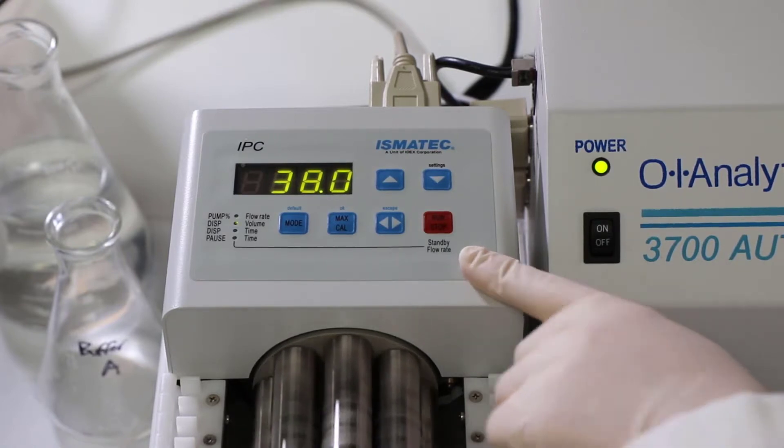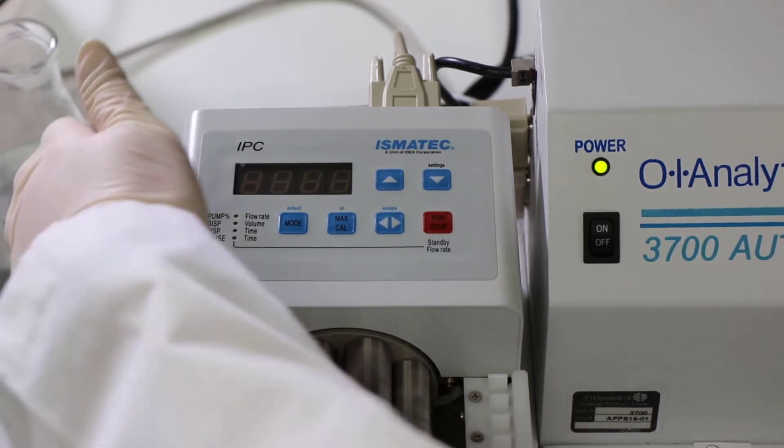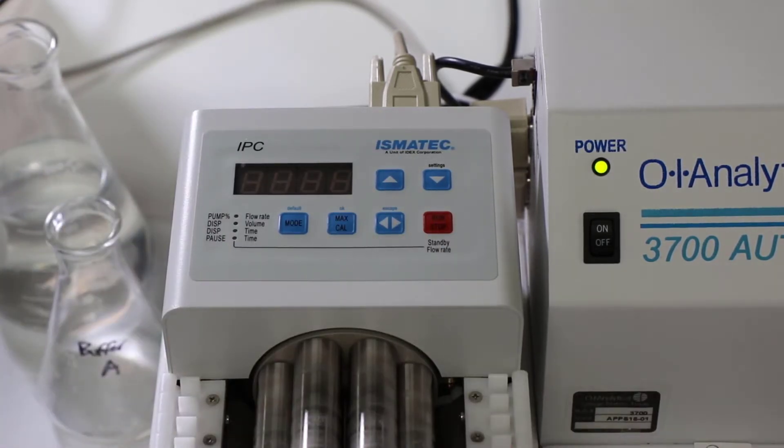From here, you're going to turn the power button off and wait 10 seconds, and this just programs the pump to run at the speed that you just set it to.